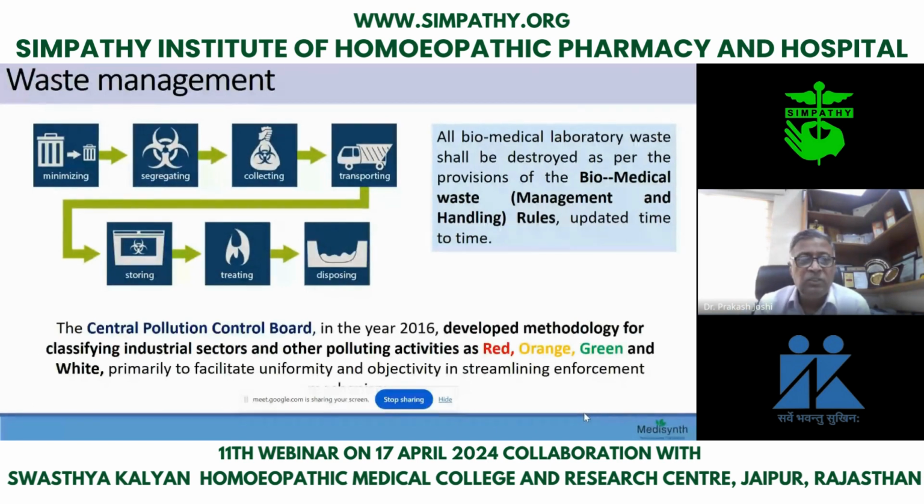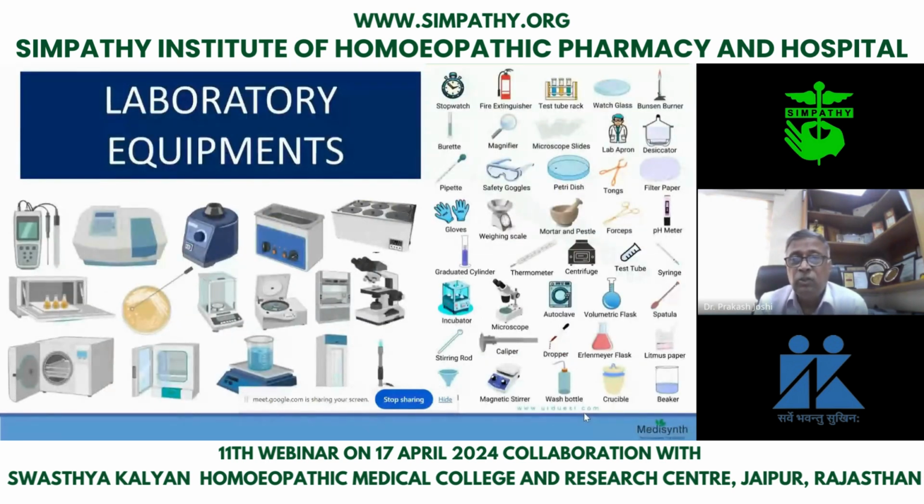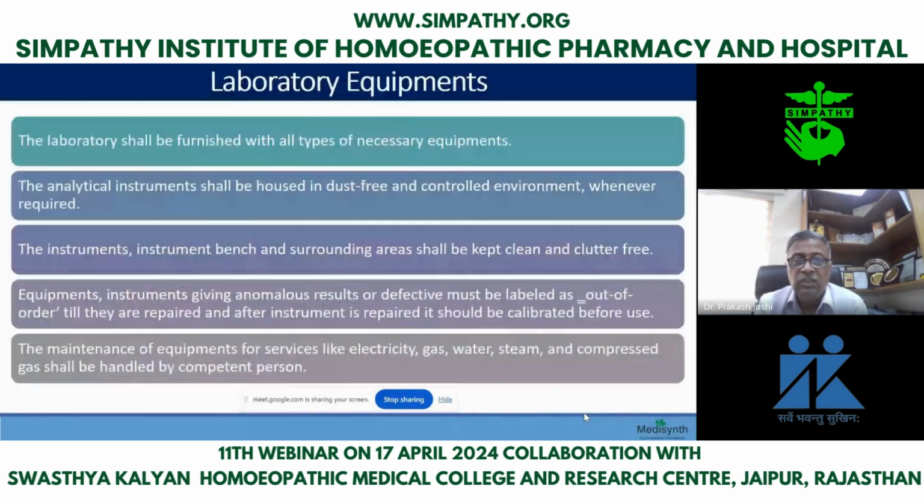And the purpose of these things is just to educate you, to make you informed. These are the laboratory equipments. These fire extinguishers are there, burettes, all these things. So these are all the basic equipments that you have seen, thermometer, microscope.